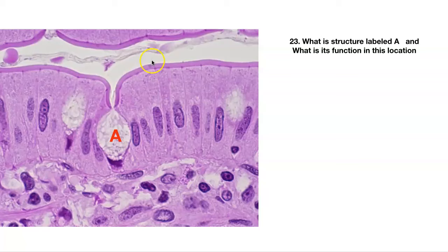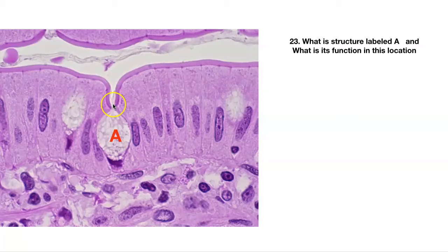Number twenty-three — what is structure labeled A? This is a goblet cell. What kind of epithelium is this? Simple columnar. You can actually see the microvilli edging up here, and here's your lumen. What's the function of goblet cells here? They're making mucus — probably in the small intestines. It's partly to lube the tube: there's food being digested and absorbed, so the mucus keeps food moving down the tube, and it also provides a mucusy protection for these cells.